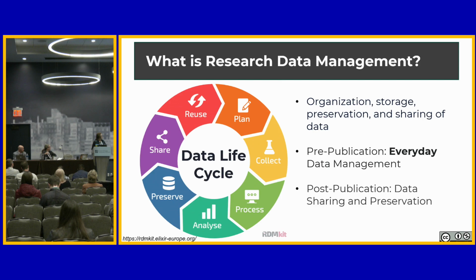So research data management is following the whole life cycle of data. It starts from planning and goes through to sharing and reusing your data and other people's data. There is an aspect that has to happen every day so that you organize your data, and this is directed more at the data producer, because often we are both data producers and data users, but let's put on the hat of the data producer.